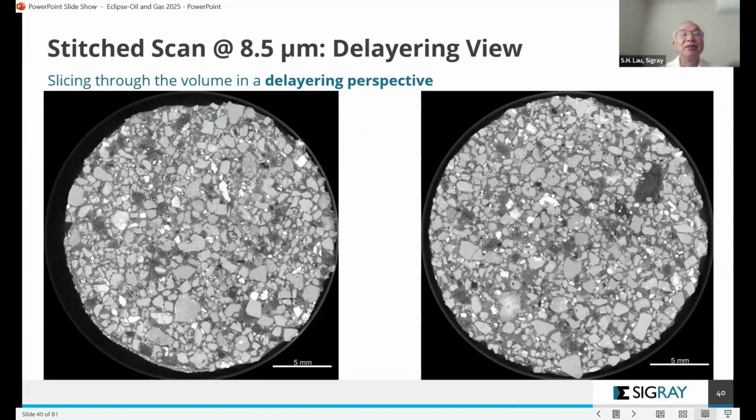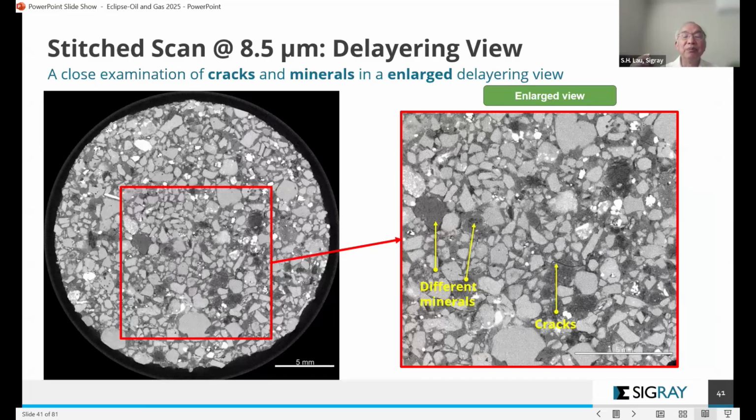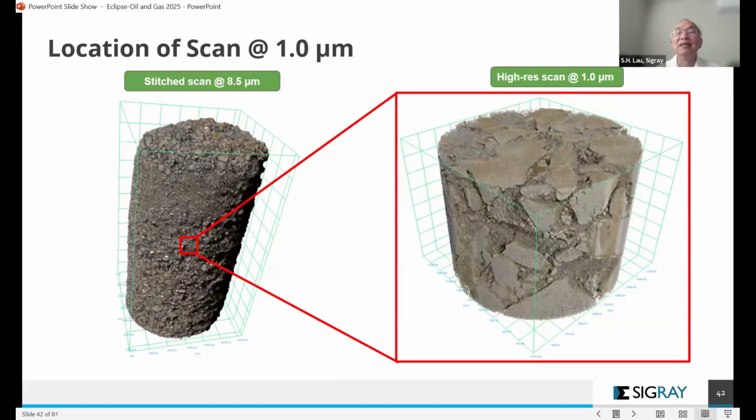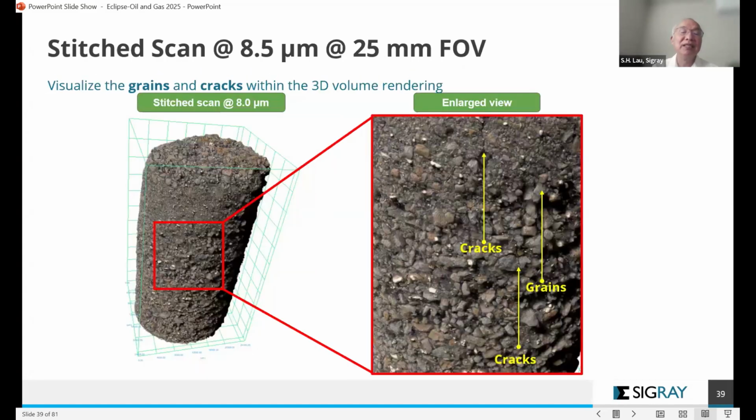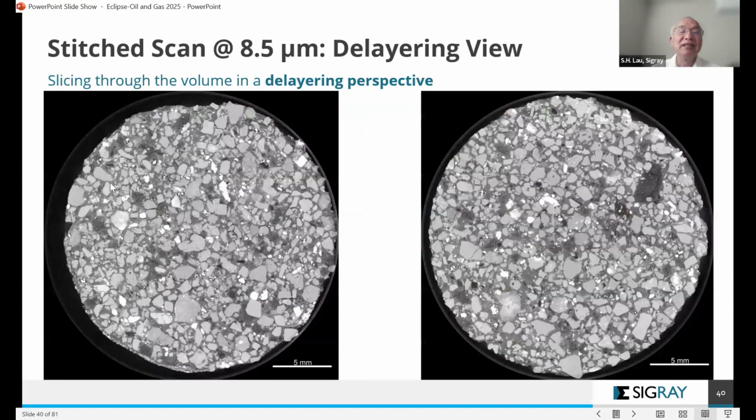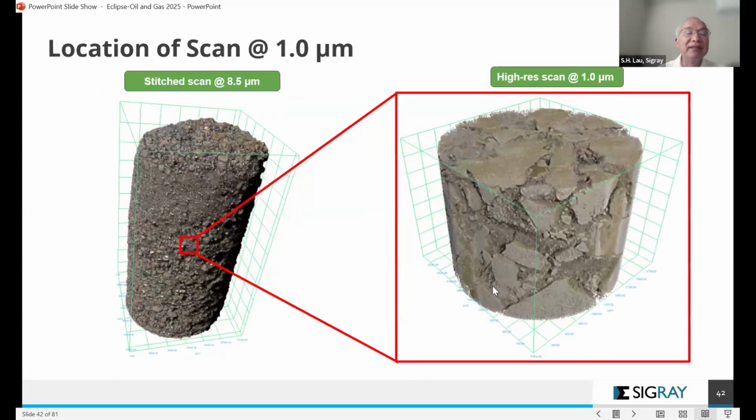You scan for 8 microns, and then after that, you continue to progress scanning at a higher resolution. Like for instance, from 8 micron, I can scan all these things like what we have seen earlier, this 8 micron type of imaging from the slice. This is 3D. This is now the slice at 8 micron. Right. Then after that, you can resample again.